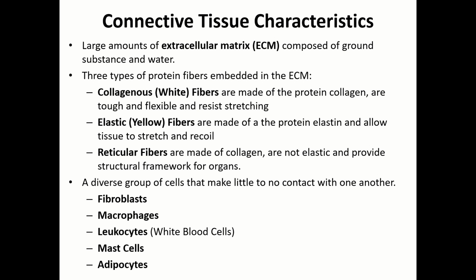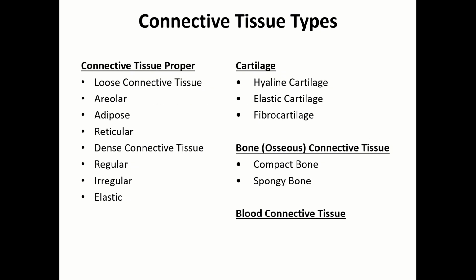In addition to the differences here with connective tissue, you'll find that the cells are very diverse. You're going to see fibroblasts, macrophages, leukocytes, mast cells, and adipocytes, so make sure you can identify those types of cells within each connective tissue type.